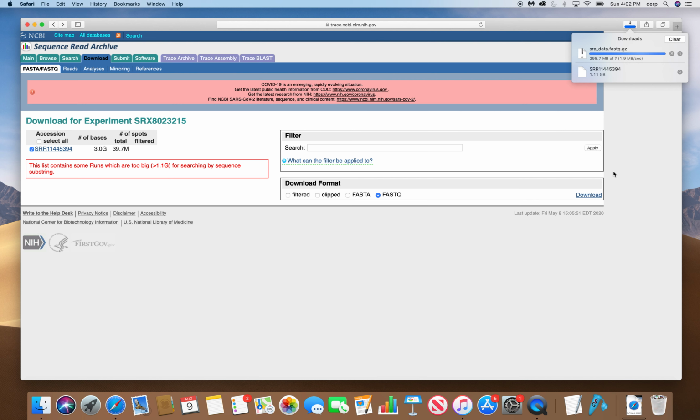So just estimating, if we're starting with 5 terabytes, if we do mapping, we're going to approximately double that just with the map summaries or the BAM files. So that bumps it automatically up to 10 terabytes. Yeah, so it gets tricky. And if we wanted to use different tools, we would wind up doubling it even more.